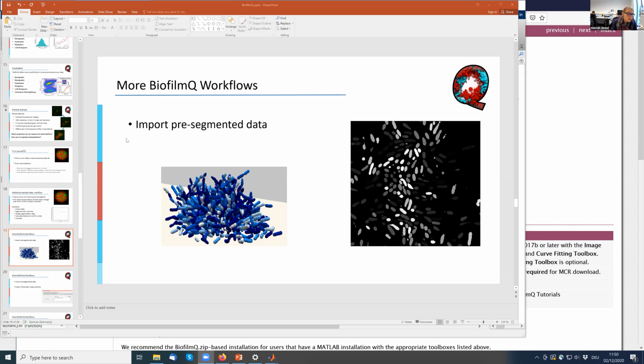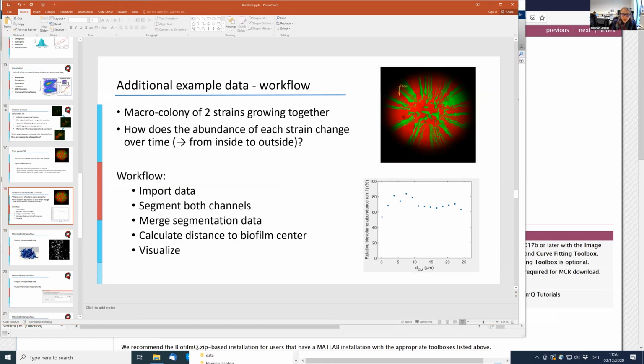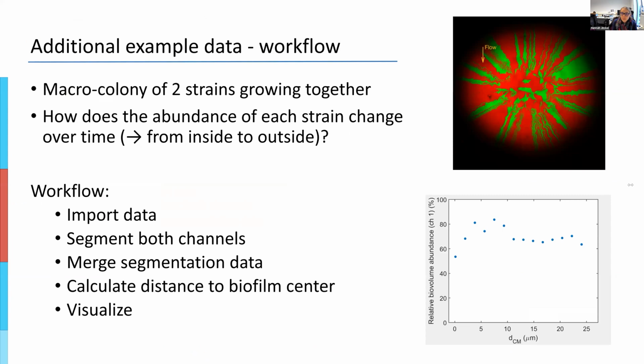All right, so I will continue here with this example data, and you can probably see this file here. I'm not sure if you've been able to open the file that I sent via email yet, but if not, that's also fine. What I want to show you with this example is something completely different from what we've seen before.